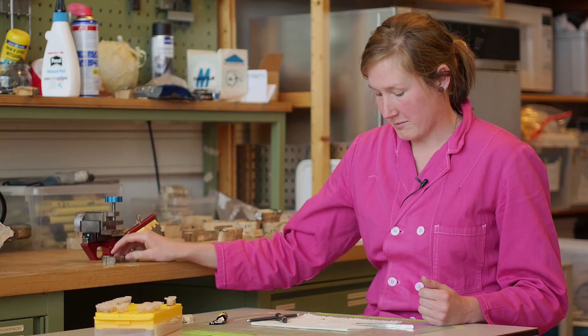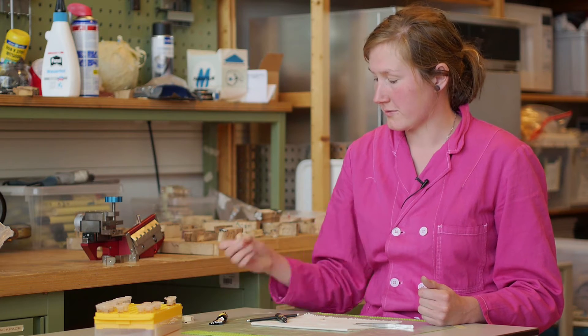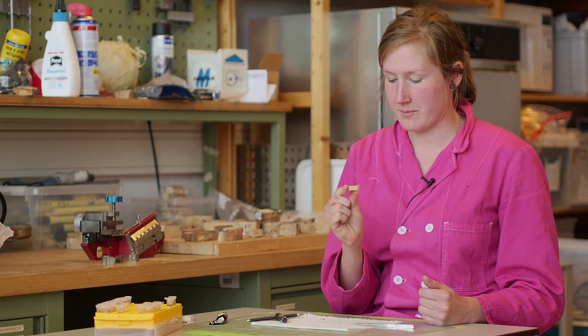You have to glue the samples on wooden holders, which makes it possible to clamp the microcores into the microtome. But if you have to glue the samples onto the holders, the glue first has to dry for several hours. This can make the sample shrink, causing cracks, and then the sample is not usable for further processing.